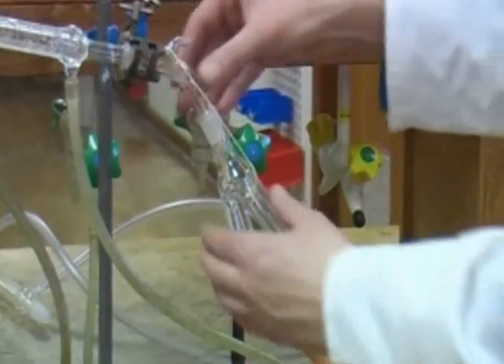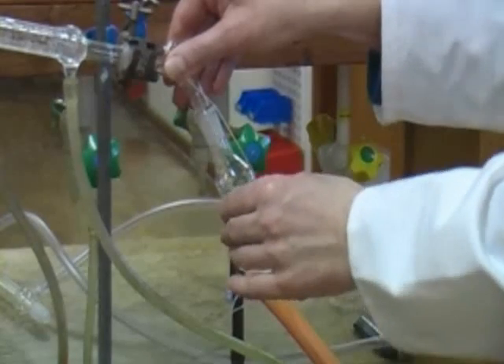We will collect the fractions using a piece of glassware called a pig, which can be easily rotated, allowing us to collect the next fraction.